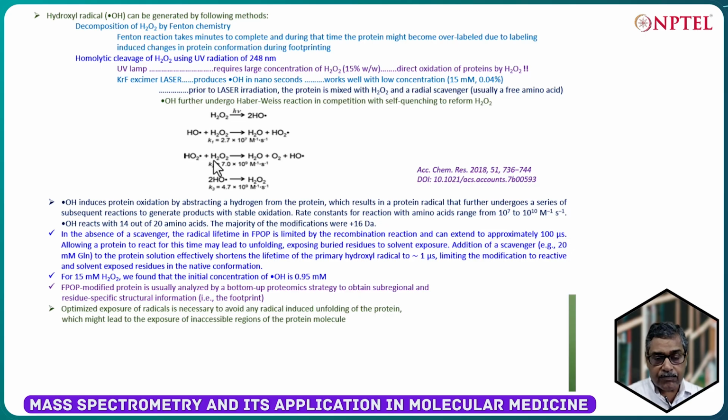If the environment is filled with normal water, then that exchanged deuterium can go back to the solvent. So, it's a reversible process, but in the case of FPOP, whatever reaction has happened is irreversible. So, the modification cannot be changed, and to find out the site of modification and extract information related to structure, we can make use of the bottom-up proteomics approach by digesting this modified protein through proteolytic cleavage.